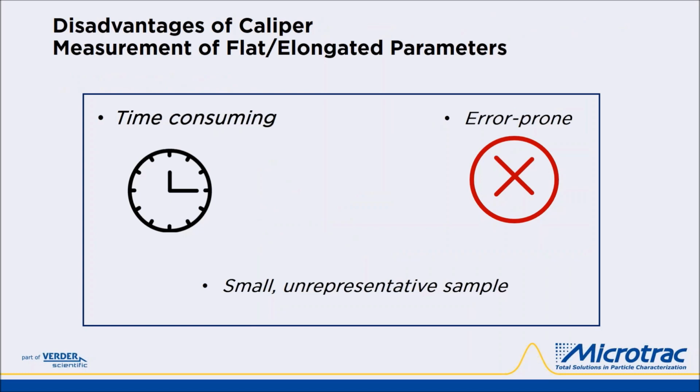Disadvantages of this caliper measurement method: very time-consuming. Measurement can take hours by a skilled technician. They're very error-prone, subject to operator interpretation, transcription, and calculation. And very small, unrepresentative samples are used, whereas every particle is measured in image analysis.